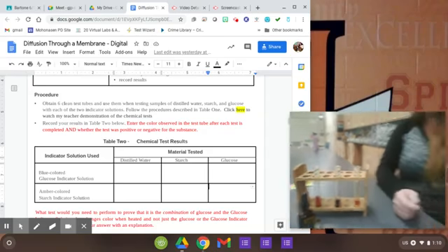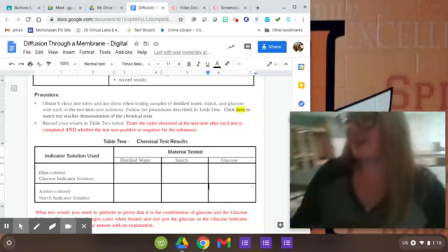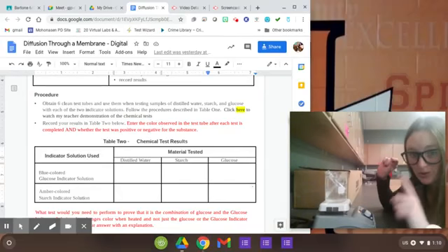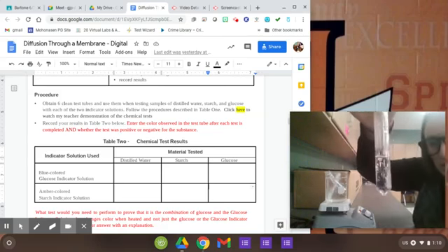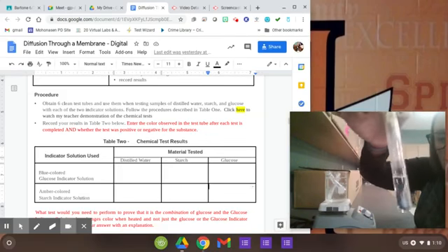Okay, so now if we take a look at our heated samples, and they're still not quite done, but you can see the results already. Now, I didn't leave these in here for too long, so they're not super hot, but normally they'd be super hot. So distilled water, we should still expect to see no change, right? And in fact, we don't see a change because there shouldn't be any glucose in here. So this should be a negative reaction.